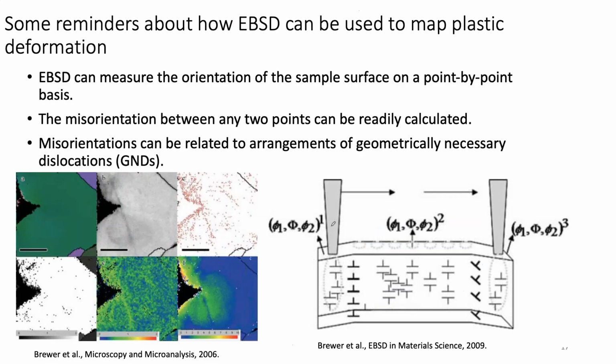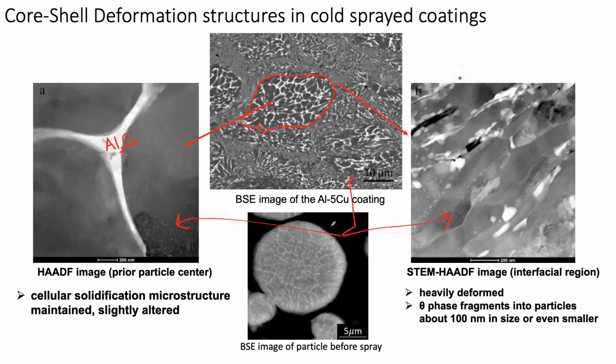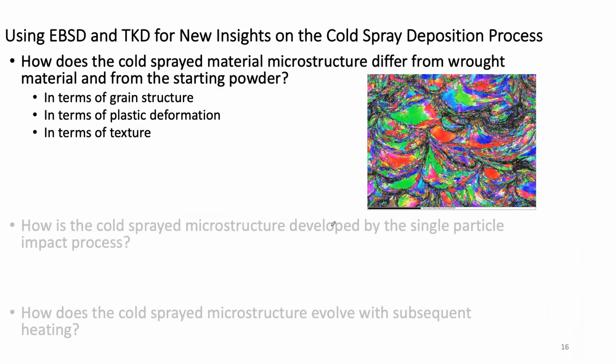So, in terms of cold spray itself, let's focus on one here. Jacob did a particularly fantastic job on this recently. These are actually all in metallographic mounts, and we follow standard metallographic procedure. One of the key things in EBSD is the finish. We find that finishing with vibratory polishing is really important, so doing a careful job of vibratory polishing is a key thing. But these are all mechanical metallography based samples of the actual deposits.